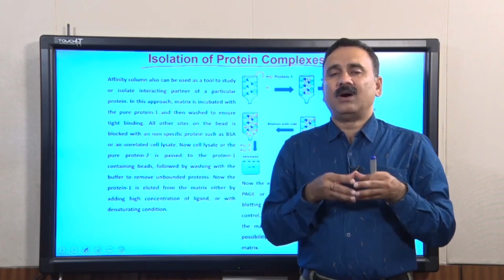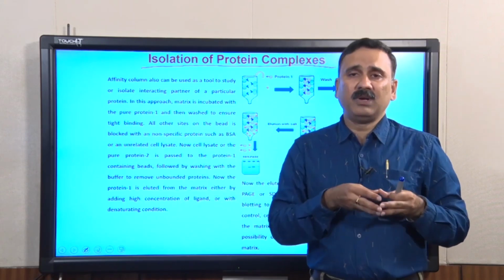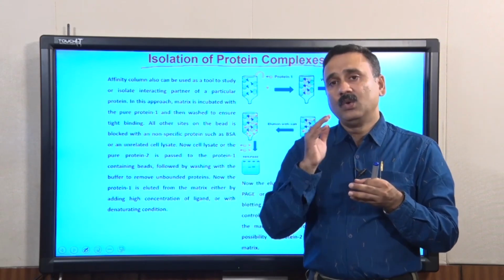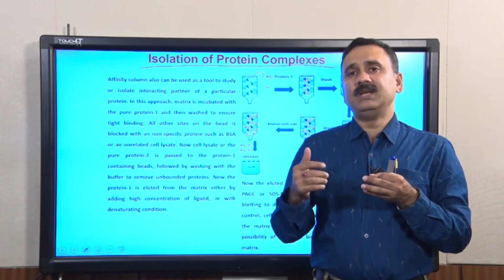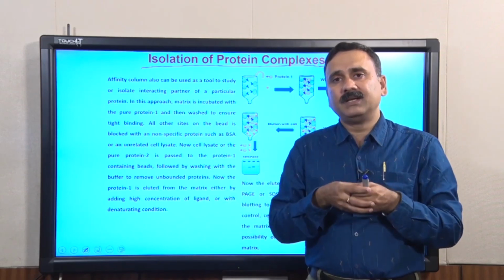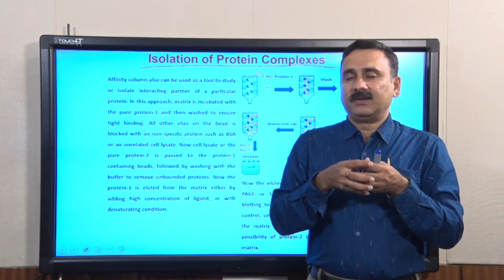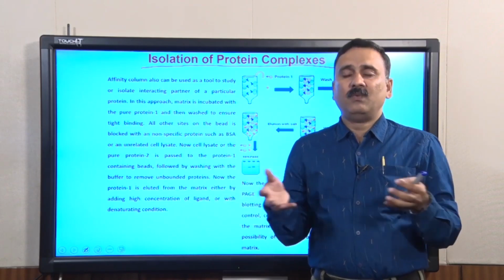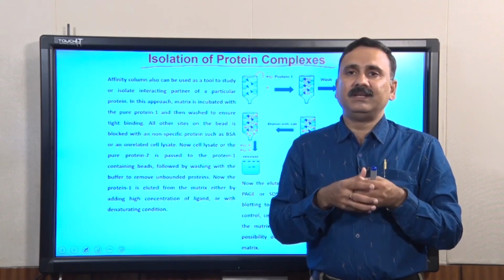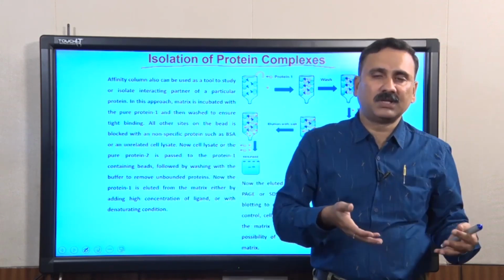So, suppose you are working in your laboratory and you are exploring this problem or a similar problem, where you are stimulating a cell and looking for which proteins are binding to this receptor, or which proteins are coming together to make multimeric complexes, like the signalosomes which are formed when a B cell or T cell is under an active immune response, like against cancer cells or against an infectious organism.